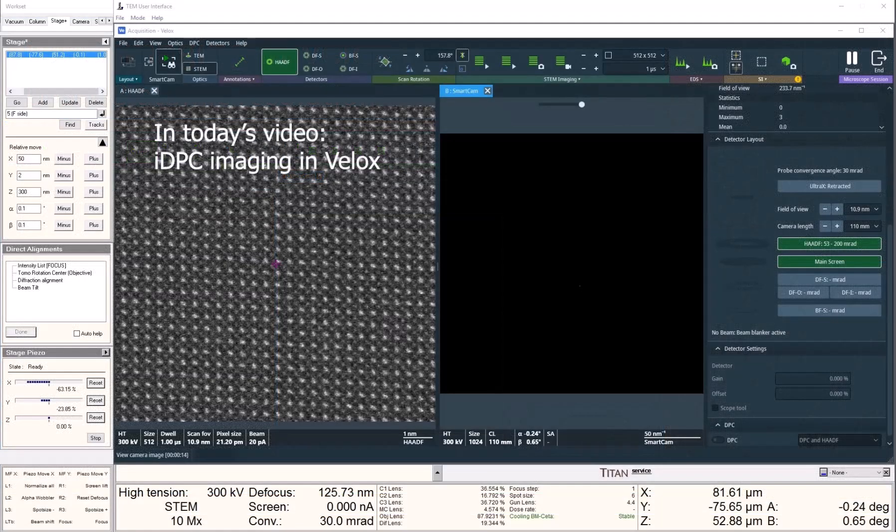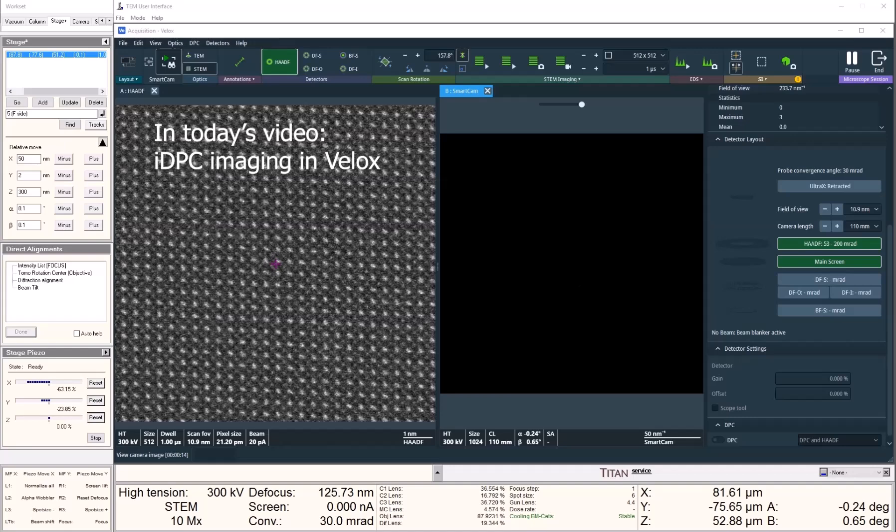Hello, everybody. In this video, I will briefly go through the capability of acquiring IDPC images in the VLOG software.